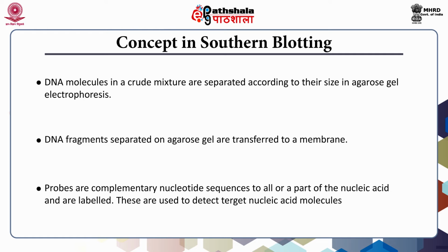The probes used for hybridization are so sensitive and selective to the nucleotide sequence that as low as one molecule of the sequence present per cell can be detected. Thus, it is also possible to determine the number of copies of a particular sequence of DNA present within the cell.